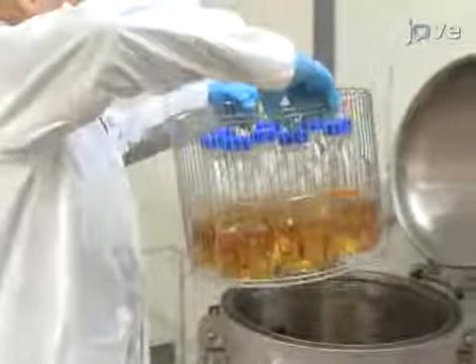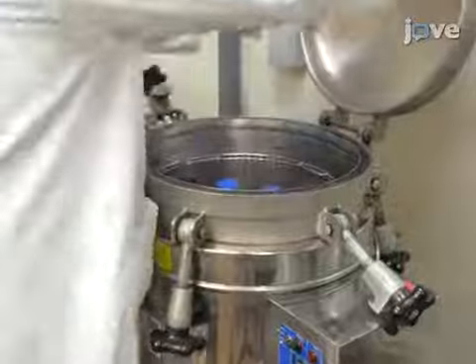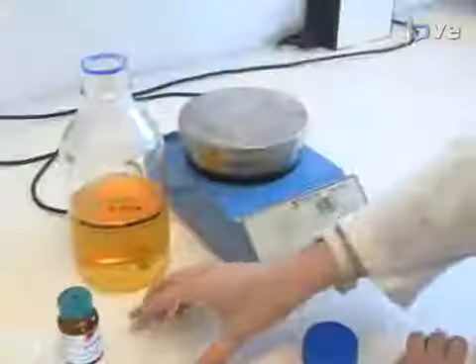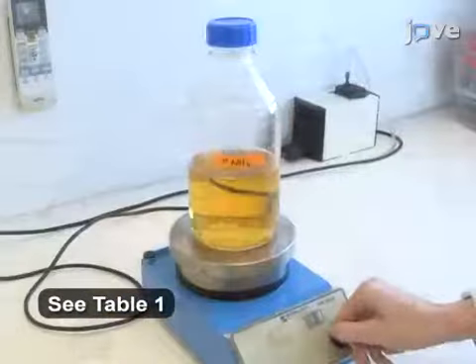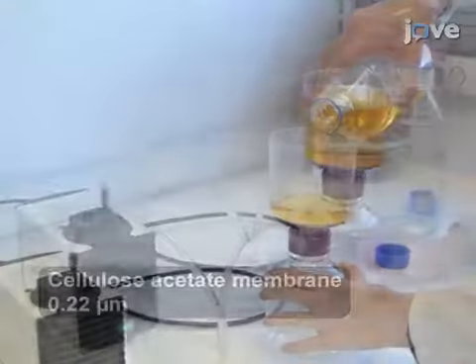In an autoclave, pasteurize each synthetic medium prepared for each nitrogen source in a 1-liter flask containing a magnetic stir bar. Dissolve the appropriate amount of labeled molecule to reach the desired final concentration in the medium. Sterilize the medium using a disposable vacuum filtration system.